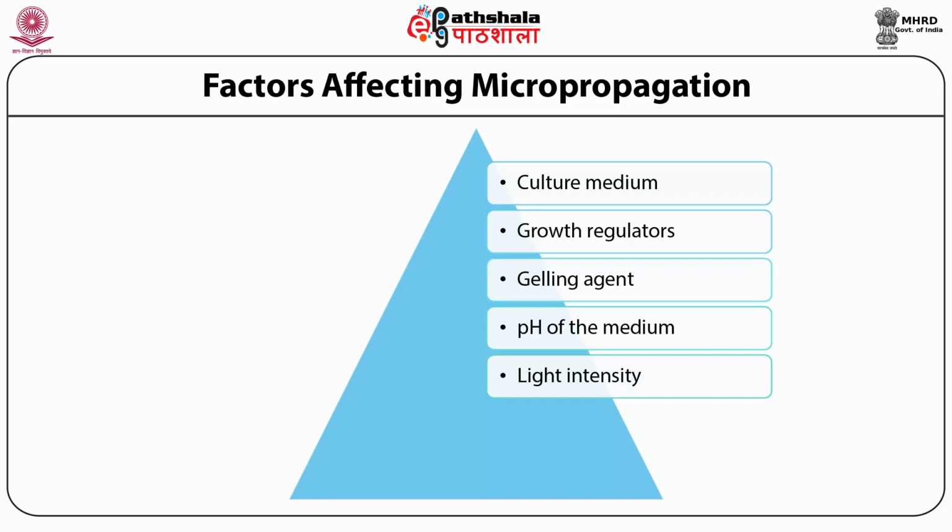As I said earlier, the culture room is completely closed. You don't have even a window; it's the door which opens into the clean area. So therefore, whatever you are giving is artificial. Your light intensity should be adequate to induce photosynthesis if possible, keep them green and make them grow. At the same time, it's expensive. Electricity is a major cost in a tissue culture company. So therefore, you restrict use of light to a minimum.